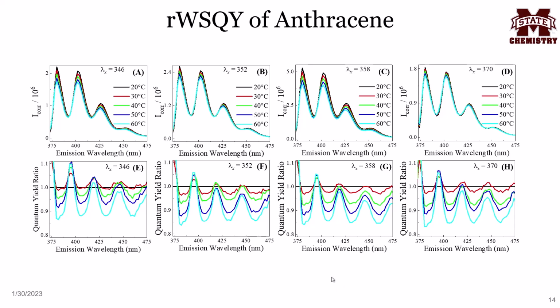However, the emission wavelengths have a strong quantum yield dependence, where some wavelengths have an increase in the quantum yield and some have a decrease in the quantum yield, shown by the peaks and the troughs. These findings are fascinating because they show that under differing conditions, we can either decrease or increase the quantum yield, which is useful for the development of anthracene in organic-based LEDs, or OLEDs.